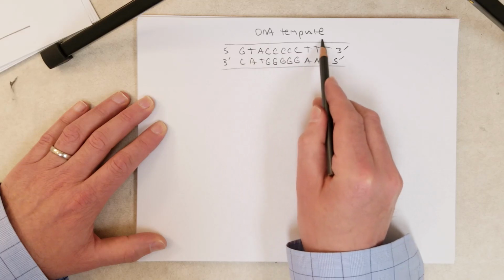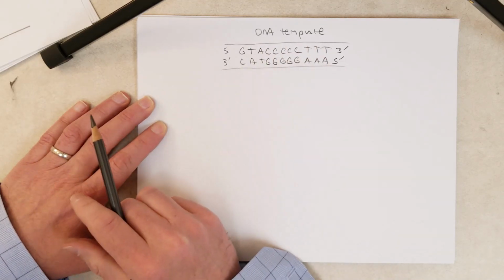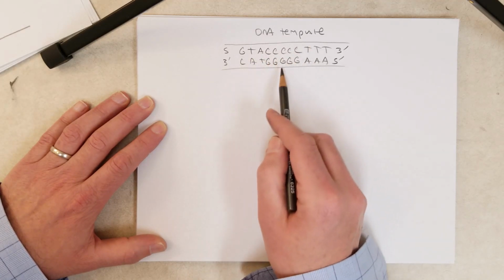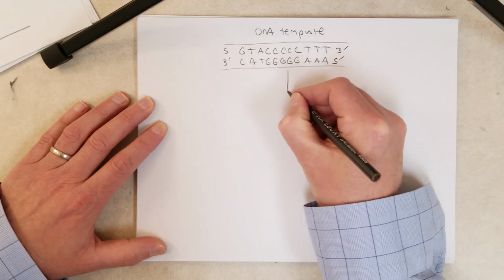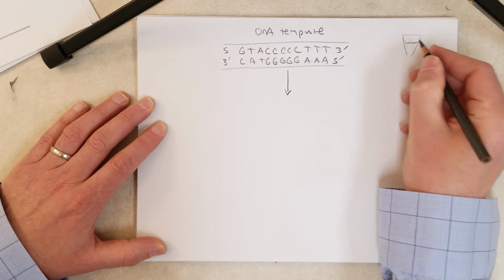Sometimes you can copy just little pieces, right? If you have a whole genome as the template, you only want to copy one gene. Well, you only want to copy part of it. But for this example, let's say we want to copy this whole thing here. First step is to get this into our PCR tube, right? This is in the PCR reaction.